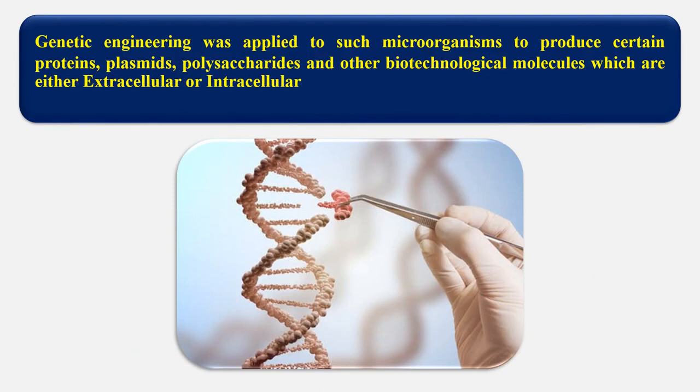However, genetic engineering was applied to such microorganisms to produce certain proteins, plasmids, polysaccharides, and other biotechnological molecules, which are either extracellular or intracellular.